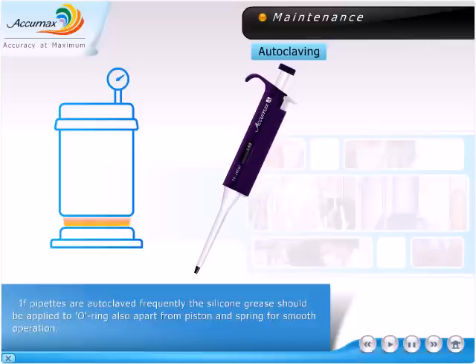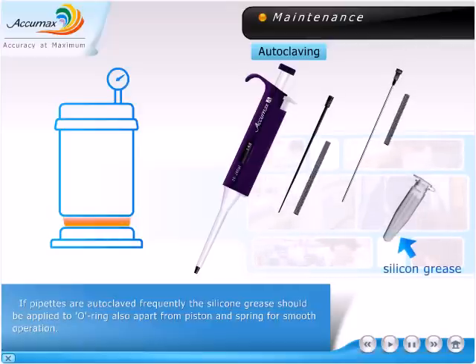If pipettes are autoclaved frequently, silicone grease should be applied on the piston and spring for smooth operation.